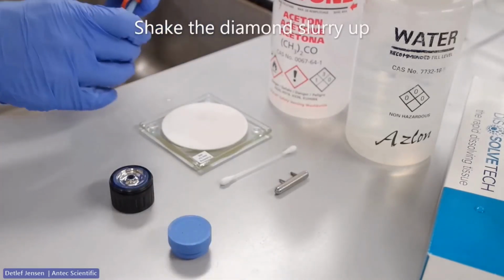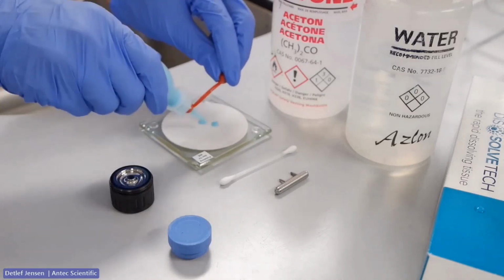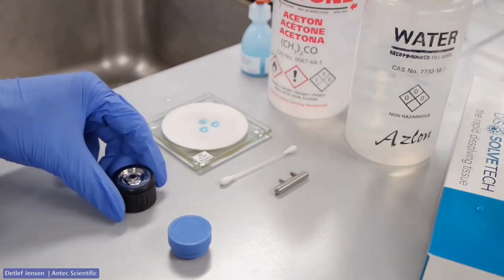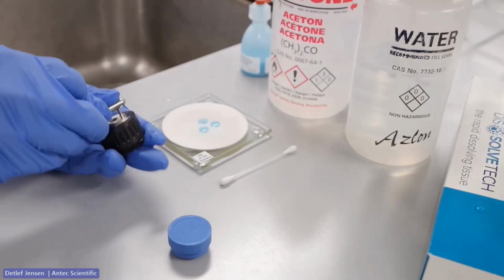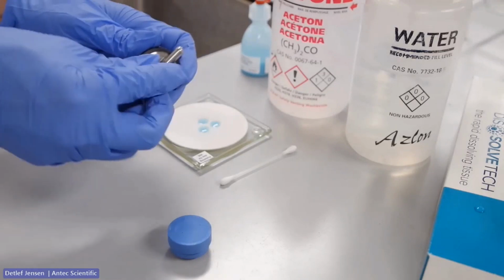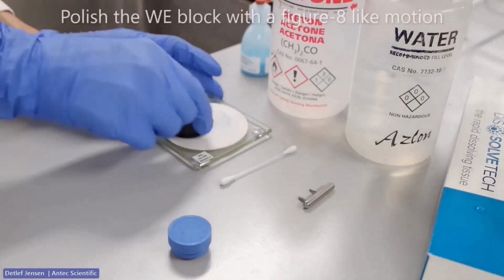One, two, three. Set the cell volume to the lowest setting, 0. Start polishing the working electrode.